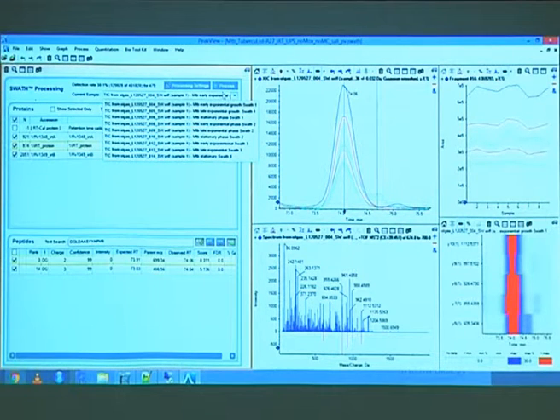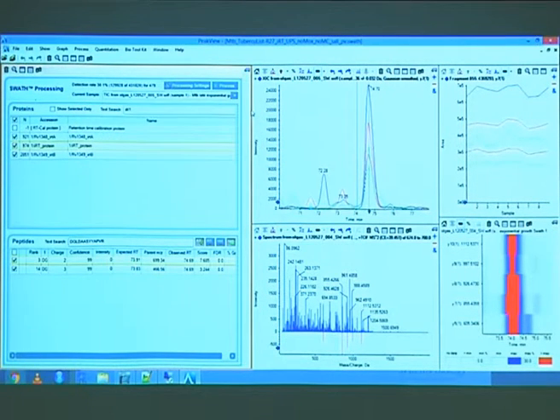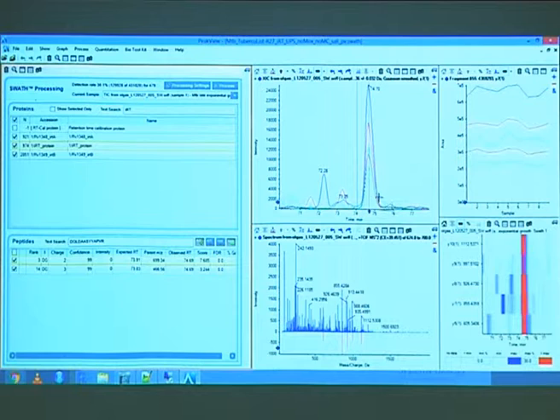These are the files here. And if I go here to now number 2, which is this one, then you see that this shoulder peak was squeezed over a bit. So there's some intensity that was added to the ion that we're looking at that actually doesn't belong there. That's an interference from another peptide.